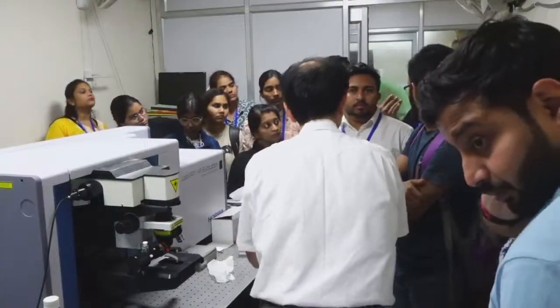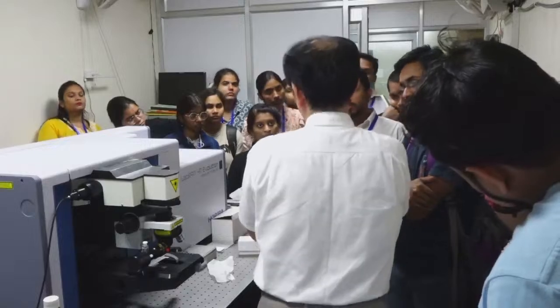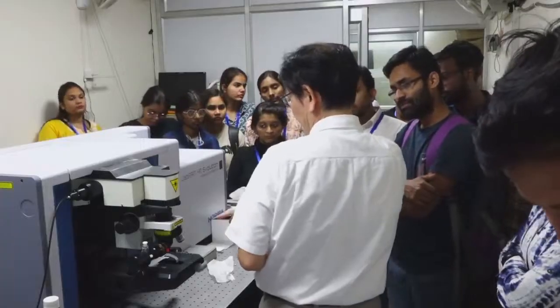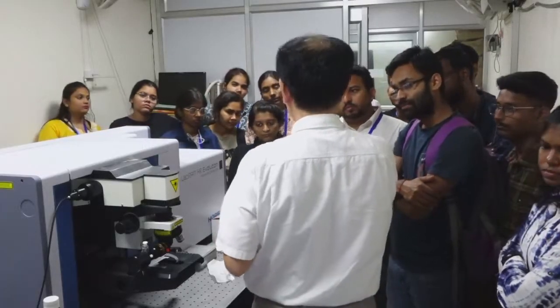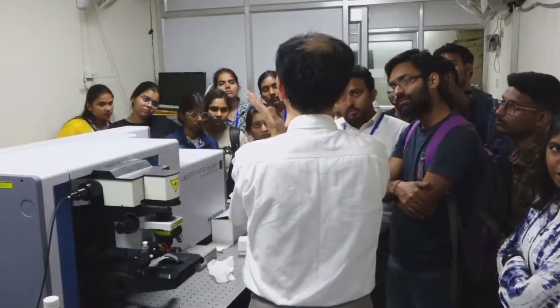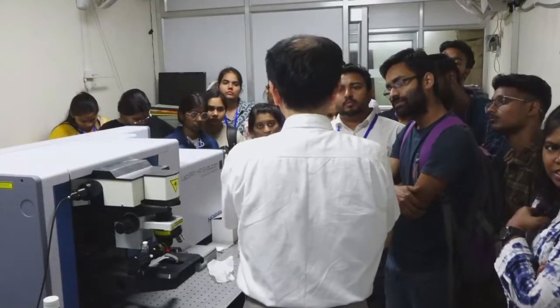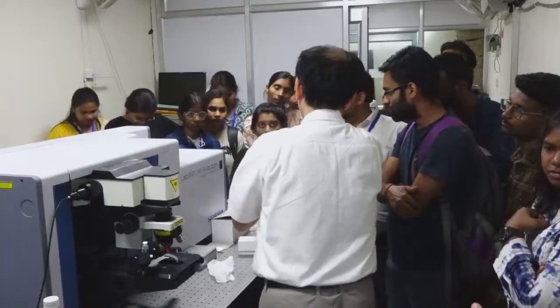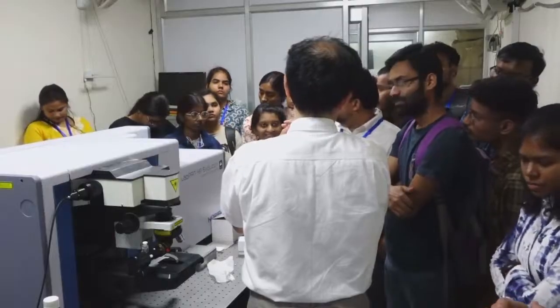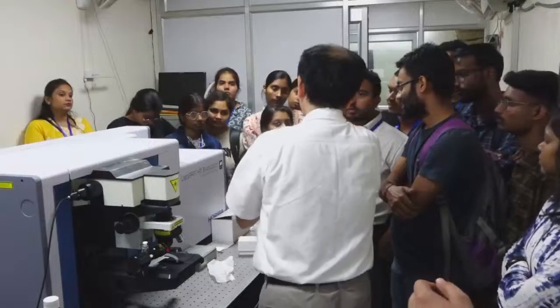How can we study biological molecules if the laser damages them? Yep. So when we put the cell or living specimen at this point, the laser power becomes too strong and burning occurs. So to avoid such a situation, we lower the laser power. That's all we can do. Lower the laser power.